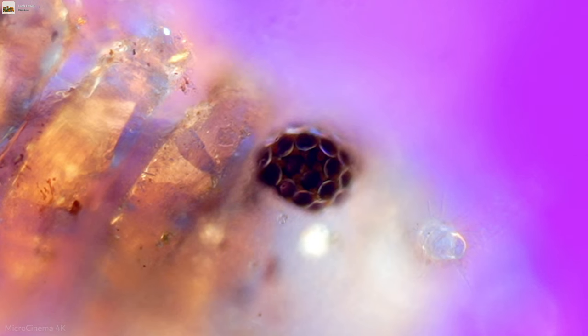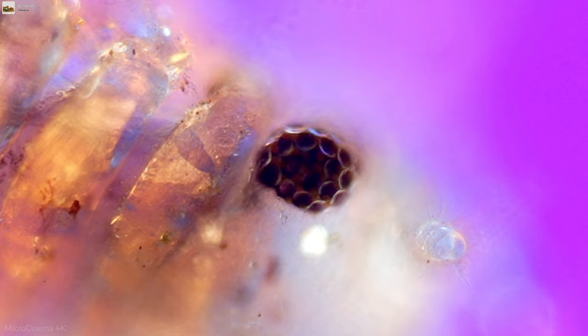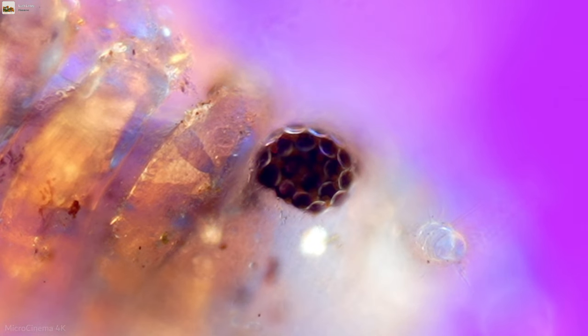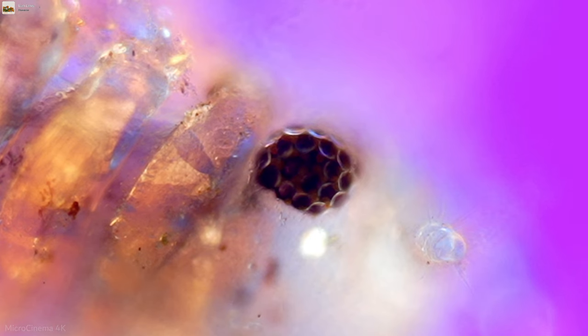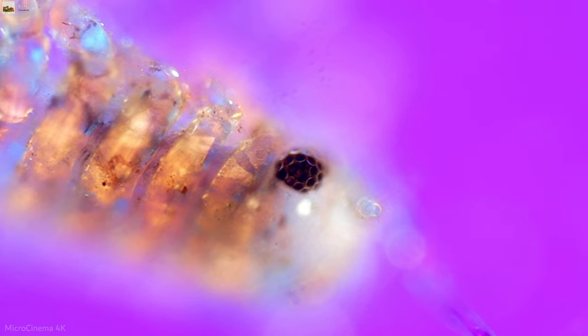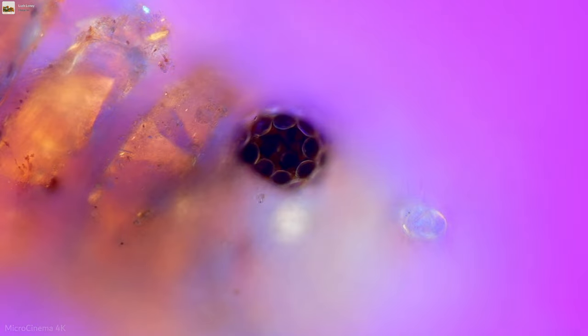Wow. What an interesting formation to those eyes. They look like the cups go in. I don't know if that's just a trick of the light or if that's actually how they are. Like you think with insect eyes, the compound eyes, they have little lenslets all over them. Let me zoom in a little bit more on this, and we can try. I don't know how well DIC will work here. Maybe I should just do bright field for this actually.